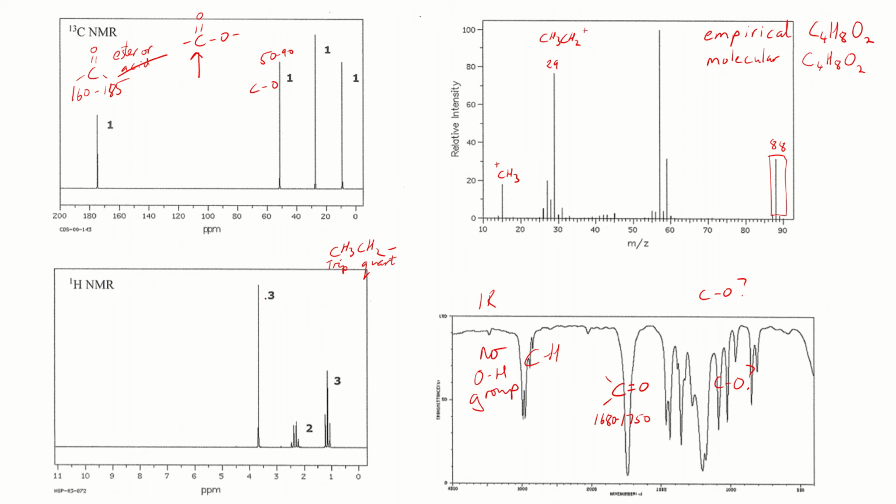Now the 3 here means we're going to have a CH3 as well. It's a singlet, so it's not going to be adjacent to any carbons with hydrogens on them. So I'm going to put that over this side. Now what CH3s are good for is they're like jigsaw end pieces. We know we've got this middle bit to fill in. So we've got the 2 CH3s. We've stuck a CH2 on one of them. Doesn't really matter which yet.